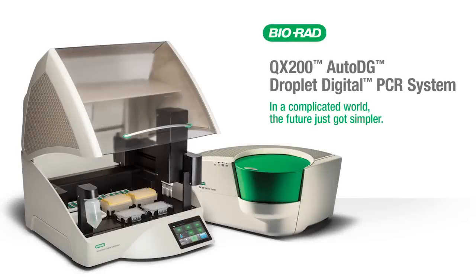From prepared reactions to droplets in only five minutes of hands-on time, with the automated droplet generator, digital PCR just got simpler.